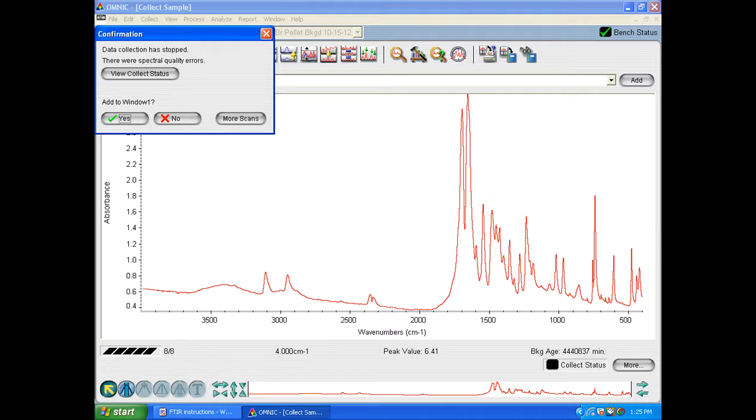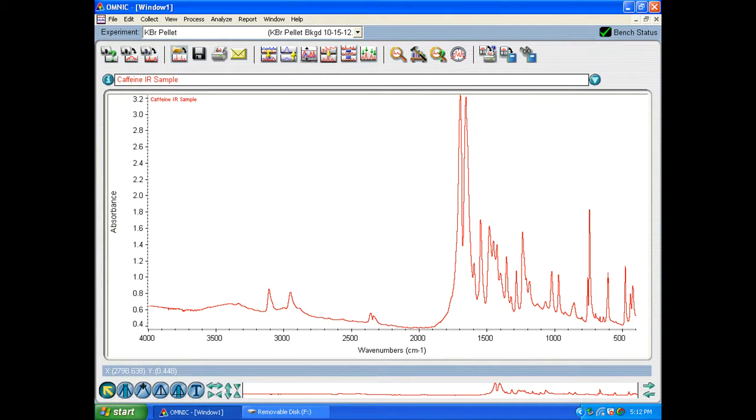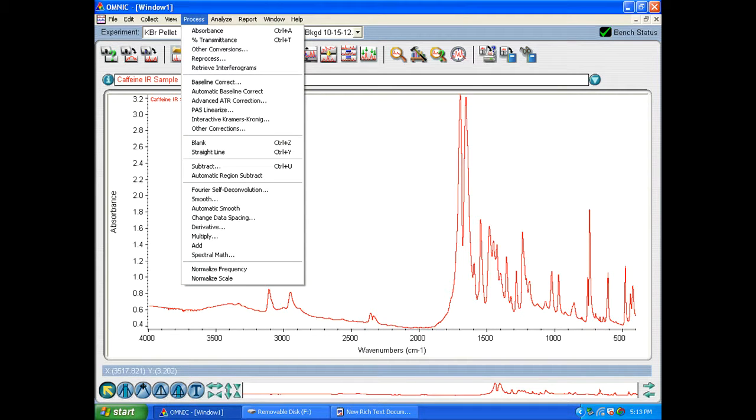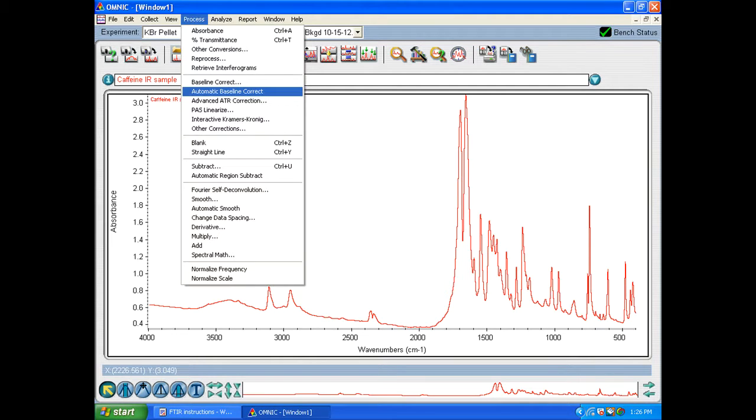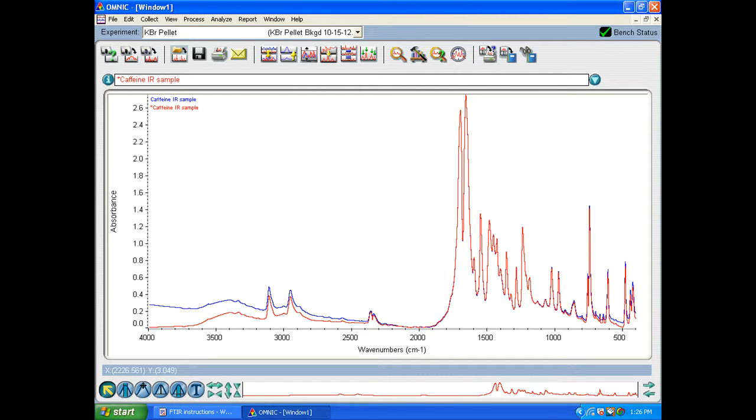Add to window one. You can hit yes. So now that we've done that what we need to do now is go up to process and go to automatic baseline correct and hit that. You'll now have two spectra on the window and it's the one that is highlighted in red and has a star up by the name. That is the new one that's the one we just did the automatic baseline correct to.